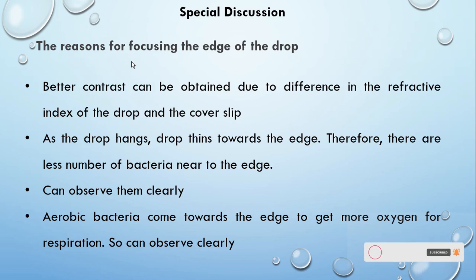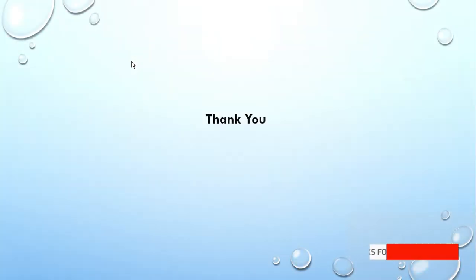As well, aerobic bacteria come towards the edge of the drop to get more oxygen for respiration. So they also can be observed clearly near the edge of the drop. Thank you.